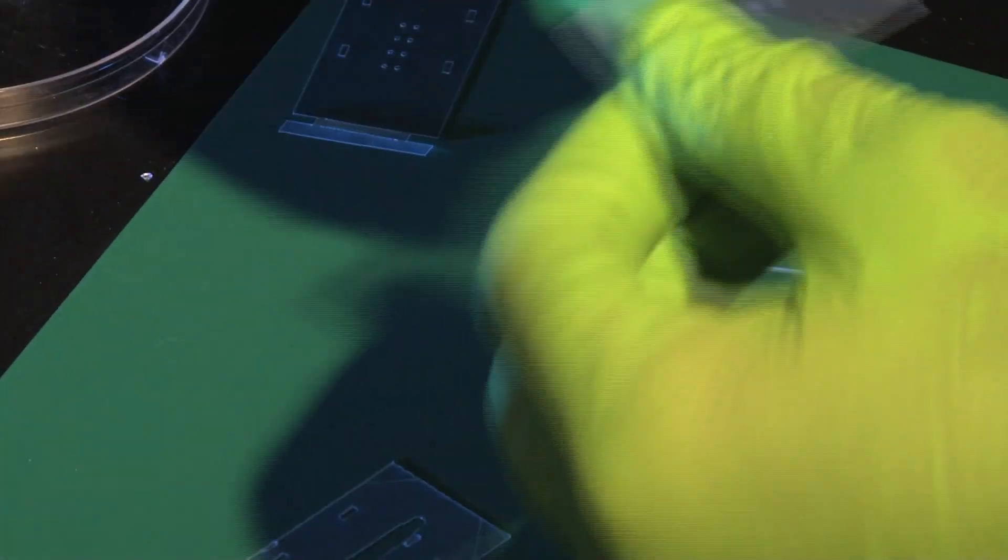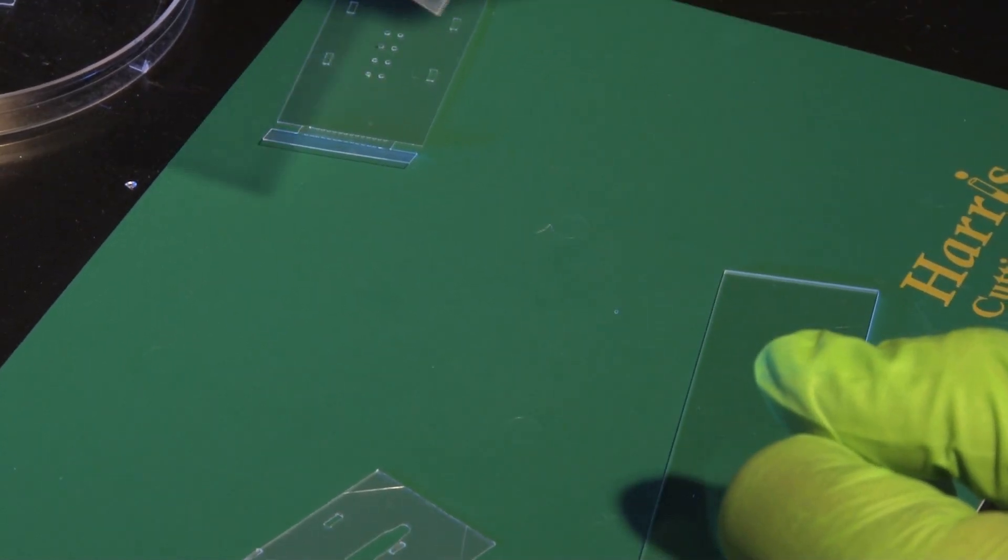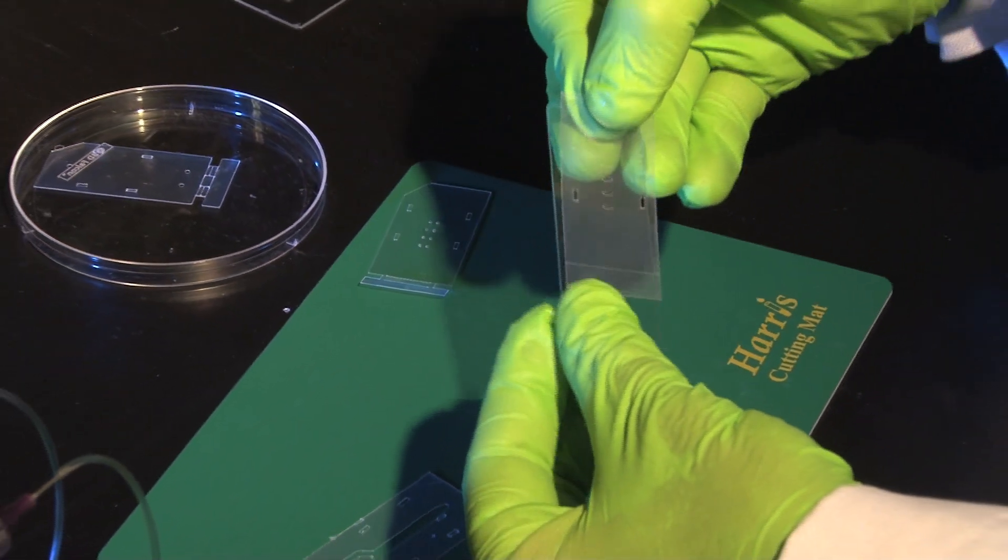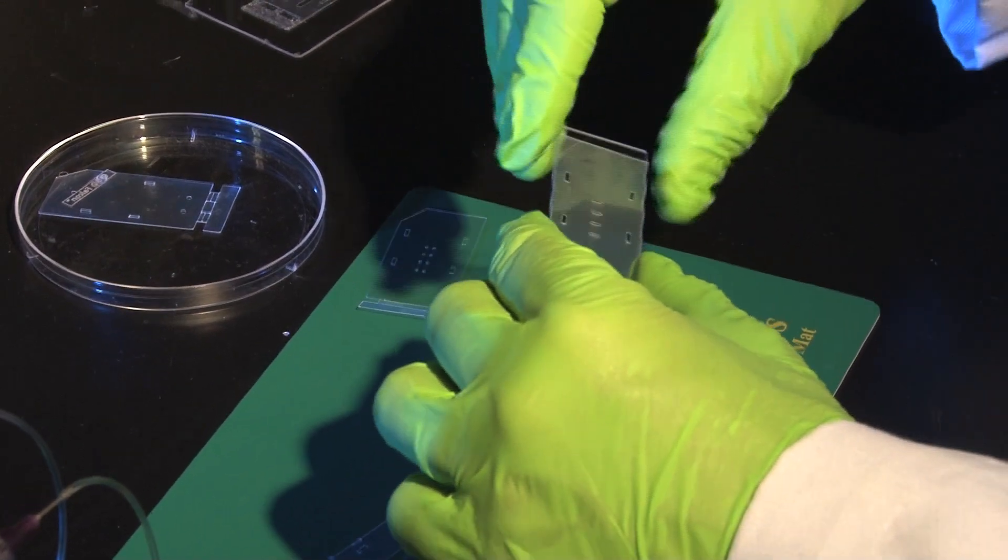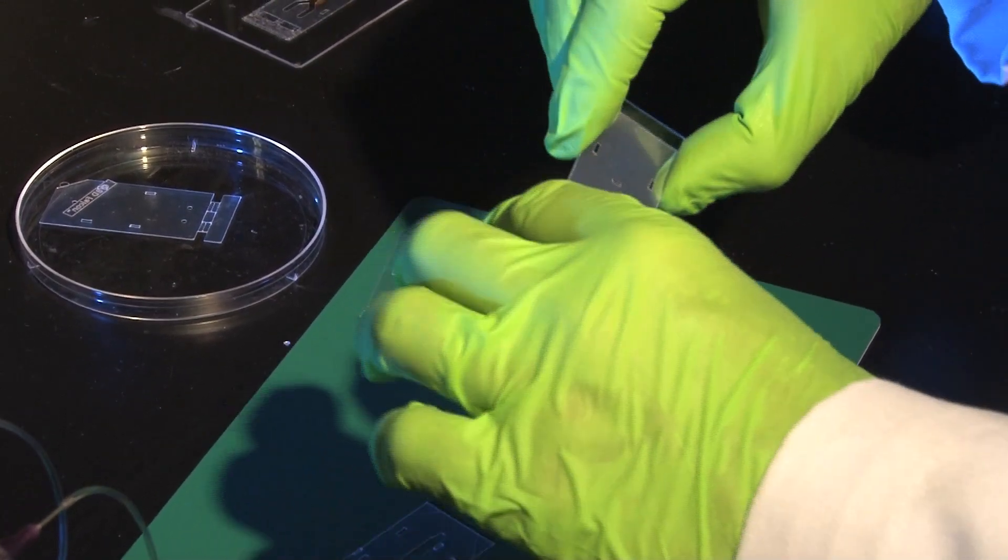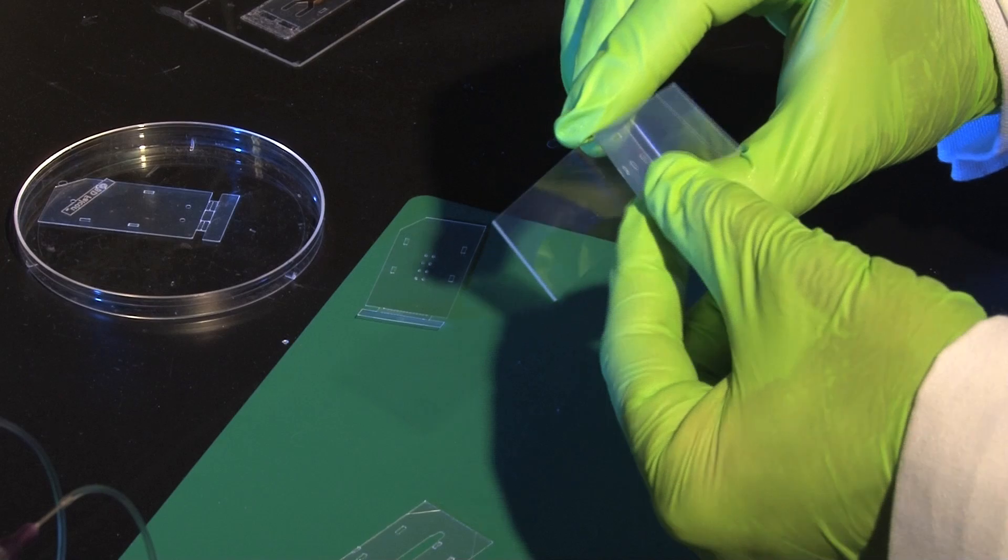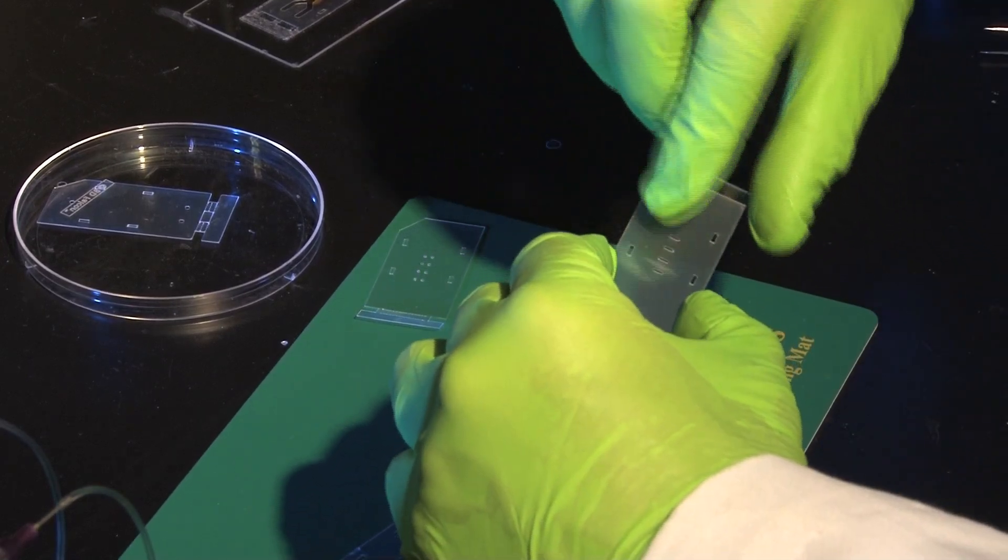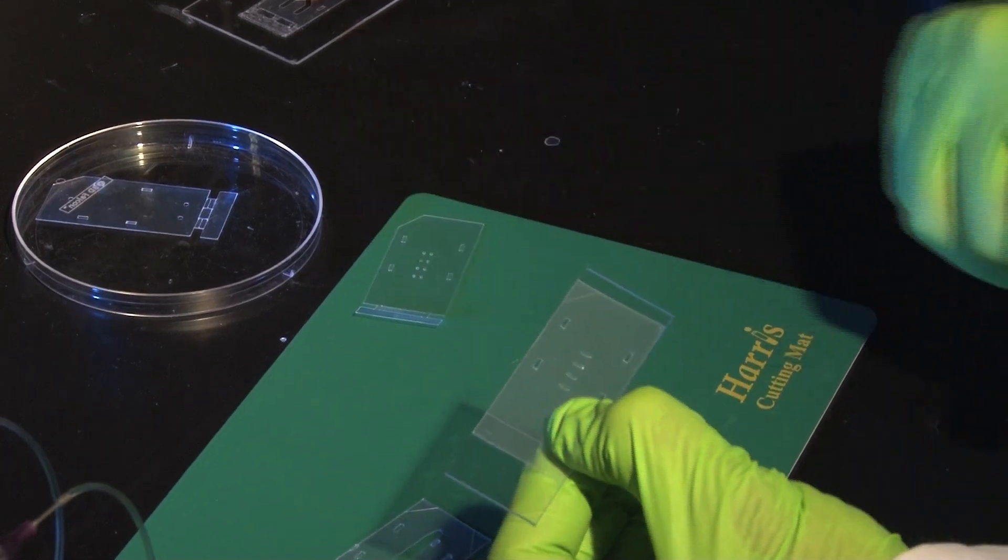So the way to assemble it would be we take one of the double-sided tape films. It's already pre-cut and we align it and place it on a glass slide. Actually I would remove from here the liner on the back side so that it actually sticks. So these little trenches will form the very channels.